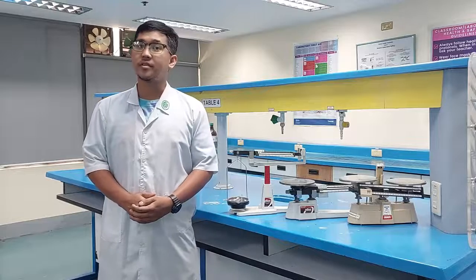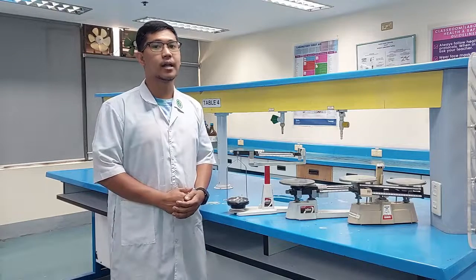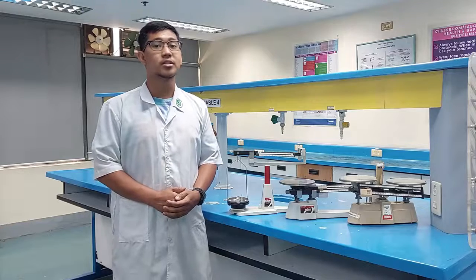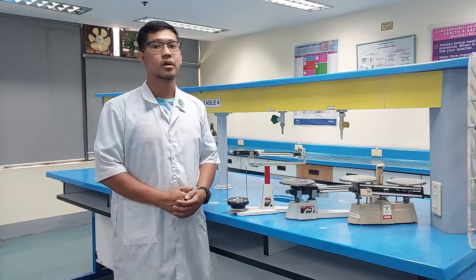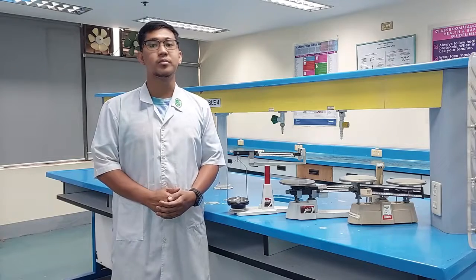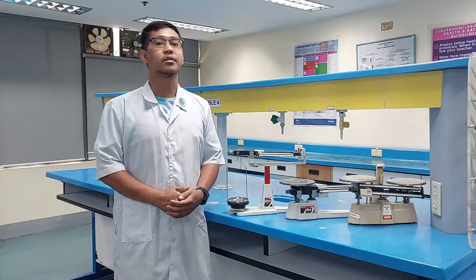When weighing by difference, an exact zeroing of the balance is not required because any error in the initial reading will cancel when subtraction of the readings occurs. However, it is always good practice to zero the balance when you begin to be certain it is working correctly.